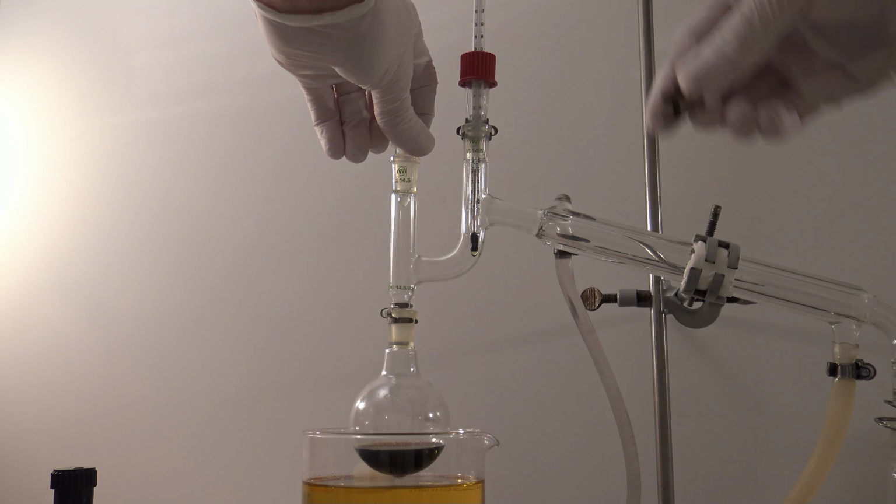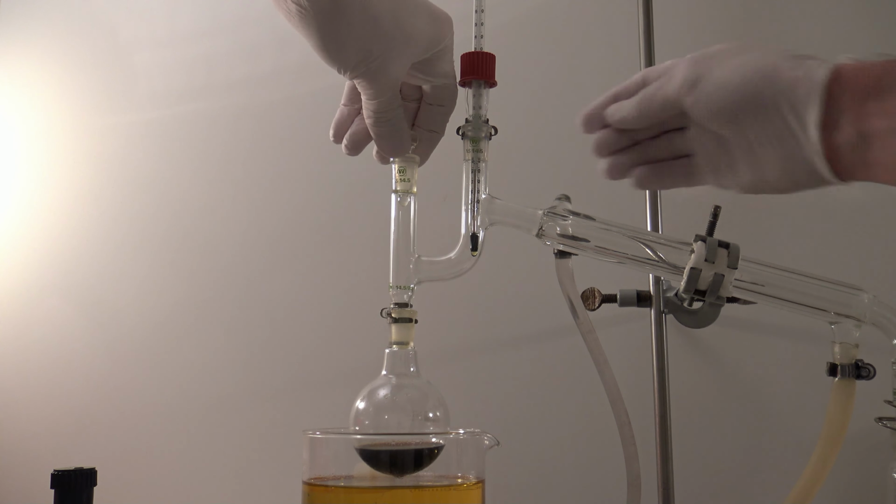To equalize the pressure, a stopper was removed very carefully and slowly. If this is done too fast, the air rushing into the apparatus could cause the compounds to splash. A yellow oil was collected which had a distinct artificial smell of cinnamon. This was due to the natural smell being caused by way more different compounds. The refractive index was close at 1.614 but below the literature value, which was why more tests were done.